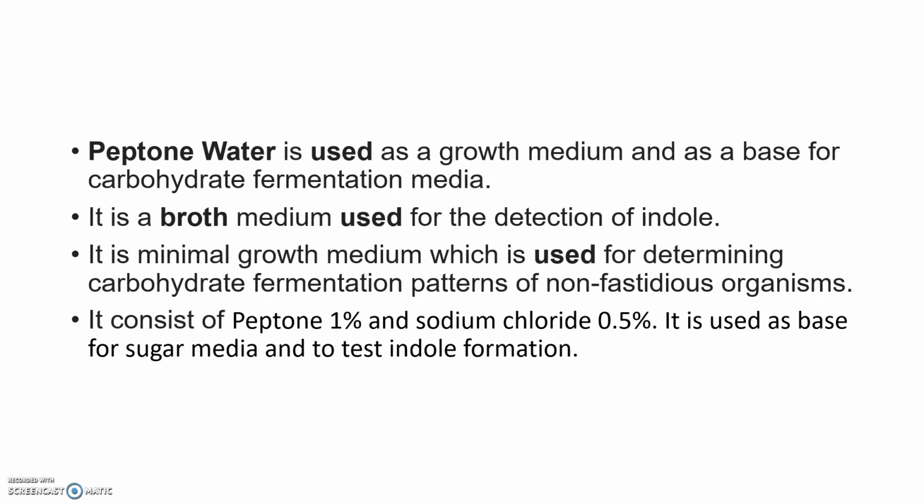The peptone water is used as a growth media and as a base for carbohydrate fermentation media. So for performing the fermentation test, we can preferably use peptone water, which helps as a growth media for the required microorganism.